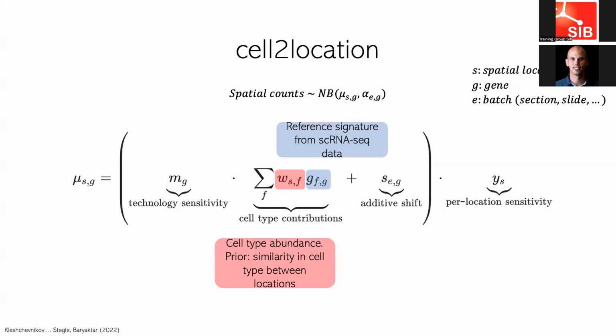There is spatial dependency to a large extent. If you predict a certain proportion of cells in one location, your expectation is that the nearby spot will have a similar proportion, or a continuous change in the proportion of cell types. It depends on how harshly you enforce this, and whether you allow abrupt changes in the tissue in terms of composition.